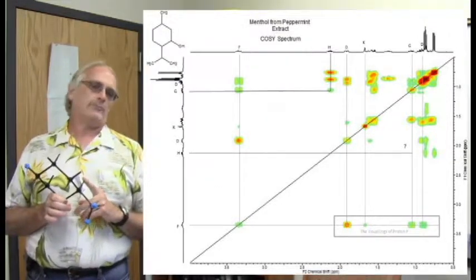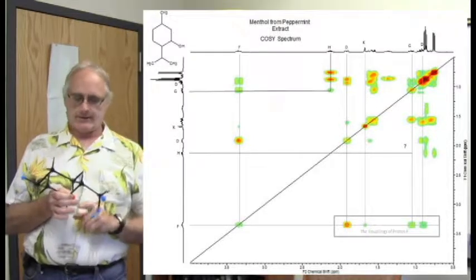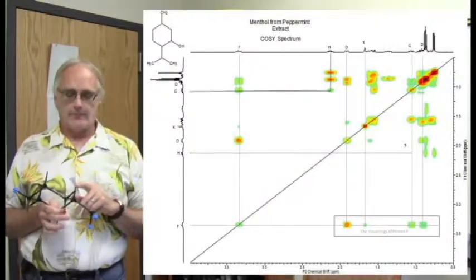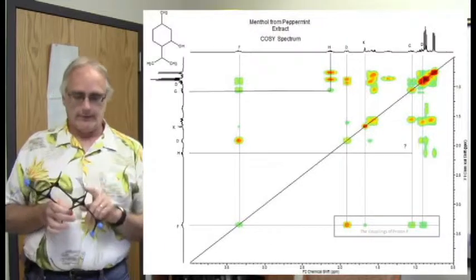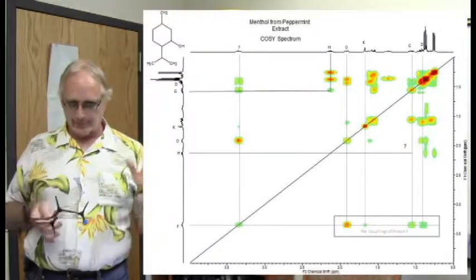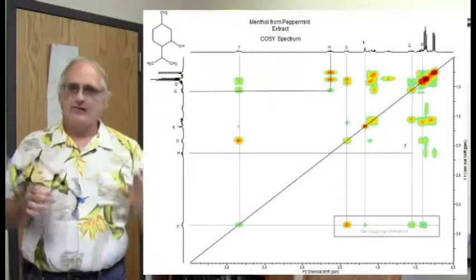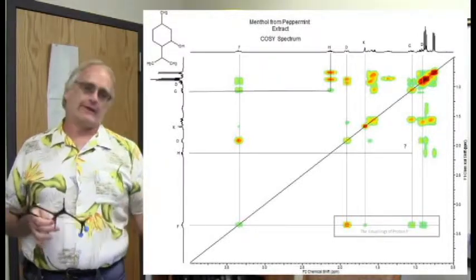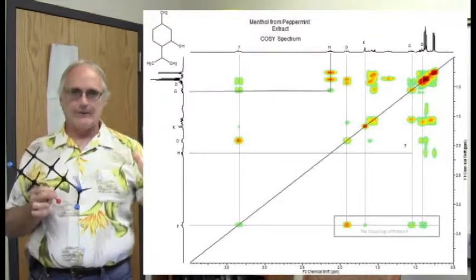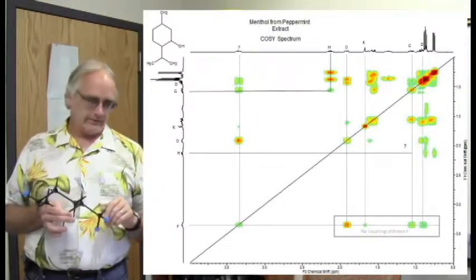I mean, there's a couple of possibilities here. One, my characterization of positions H and G and F here is wrong, and the experiment is telling me that I've gone off the rails someplace. It's not unheard of. I hope it's not true, but be on the lookout. Or the crosspeak is weak enough, and while the two sides of the diagonal ought to be very similar to each other, in reality they're not always, that I may not have sliced into the mountain range quite deep enough when I put the COSY spectrum together. On one side of the diagonal the crosspeak is a little bit higher than the other, so it shows up on one side but not on the other, and that's what's throwing me off. So you go back to the raw data just to see what's happening here.